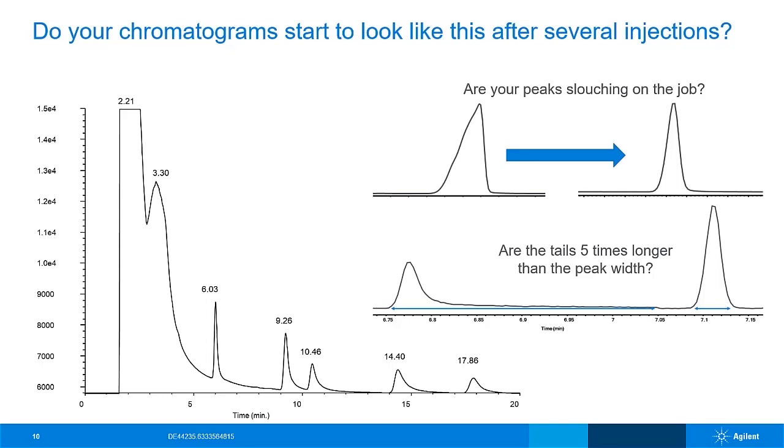And the other is the retention time. Retention time changes because we're losing the stationary phase, right? The bleed is a stationary phase that is just being removed from the column and going into the detector. So these are the two conditions that we're trying to solve and see how we can optimize our column so that we don't get up to this point.